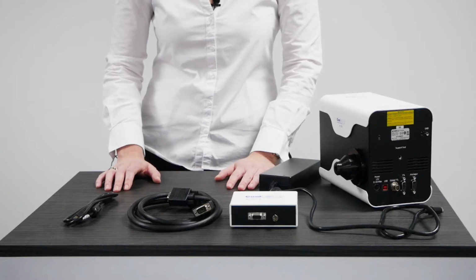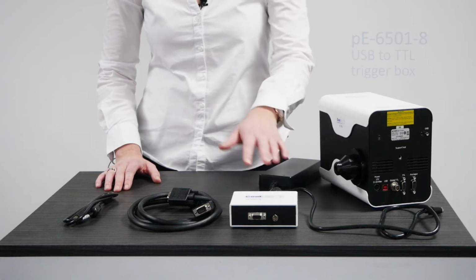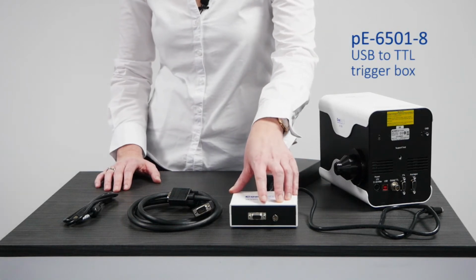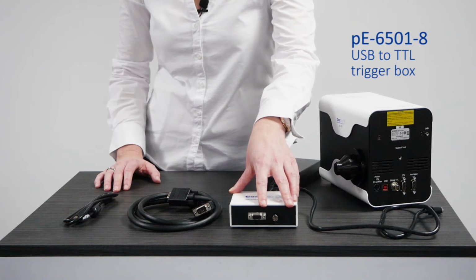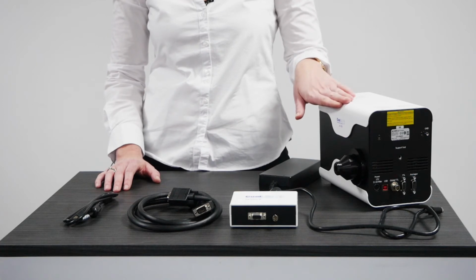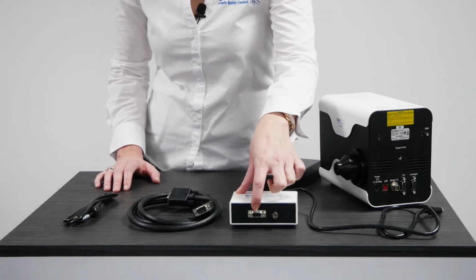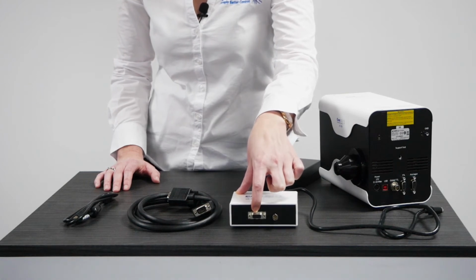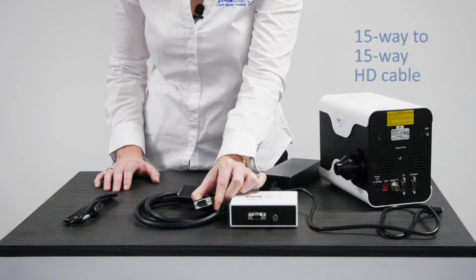The USB to TTL Conversion Kit contains several items. The pE-6501-8 has 2 connections at the front, and these are both for TTL output. 8 of these connections, i.e. one for each channel of the pE-800, come from this 15-way connector, and this connects to the pE-800 using this 15-way cable.